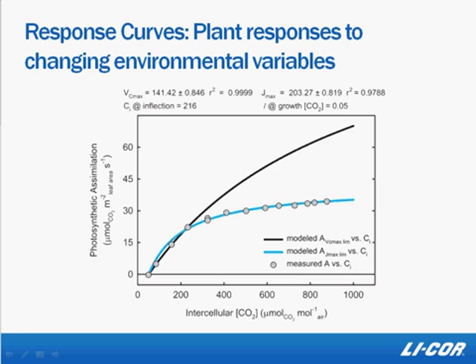Response curves, on the other hand, tell us how a plant responds to a specific environmental variable. All the other variables are held constant as best we can. Response curves allow us to measure how a plant responds biochemically and physiologically within the living leaf. We can then correlate those measurements with information about growth, development, or even other survey measurements.